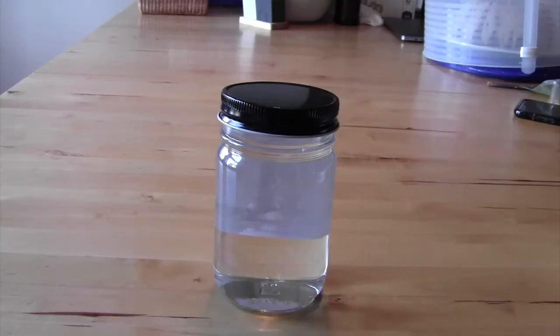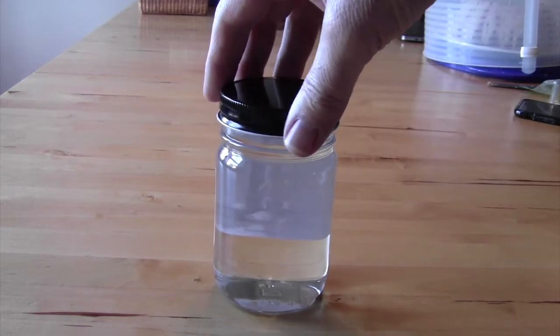Done. We're going to measure metabolic rate via oxygen consumption, how much oxygen these fish are taking out of the water. And we're going to use what's called closed respirometry, where the fish are sealed up in an airtight container. You know how much oxygen was in the water to begin with, and then you put the fish in, you know how much oxygen is in the water at the end, and the difference between the two is how much the fish consumed.